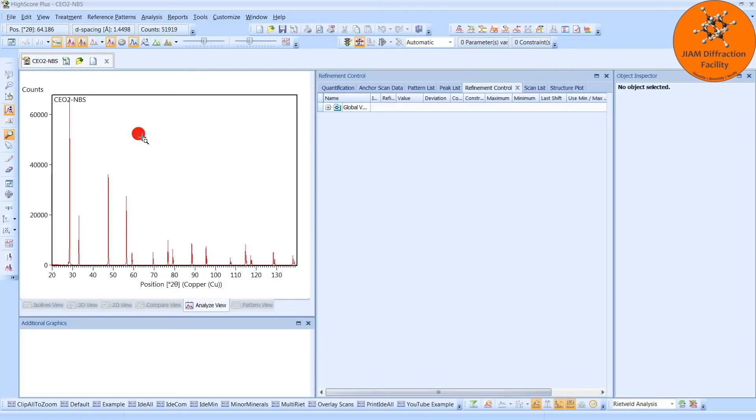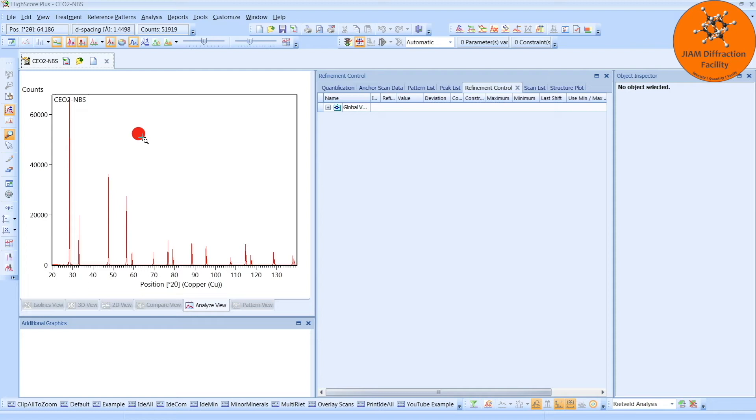I am only using this file because I will be analyzing data provided by Panalytical. If you want to analyze your own samples, you need to get your own line profile standard. You can get these from NIST, you can get Cerium Oxide, Lanthanum Hexaboride, or Silicon as a few examples. And you would prepare the sample and collect a diffraction pattern on it using the same instrument and the same optics as the samples that you want to analyze.